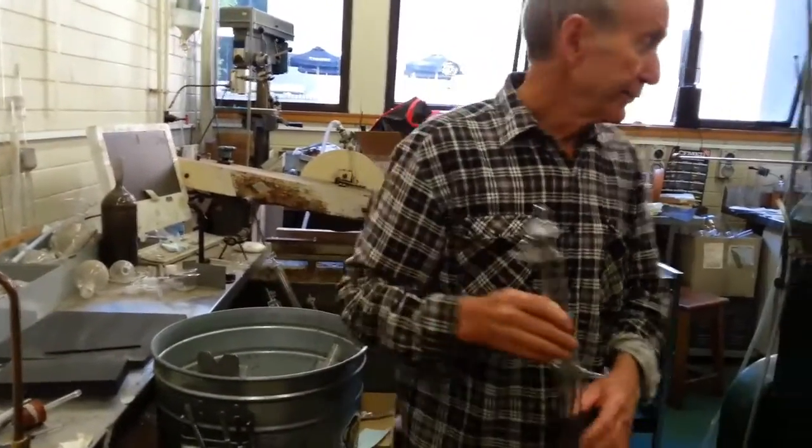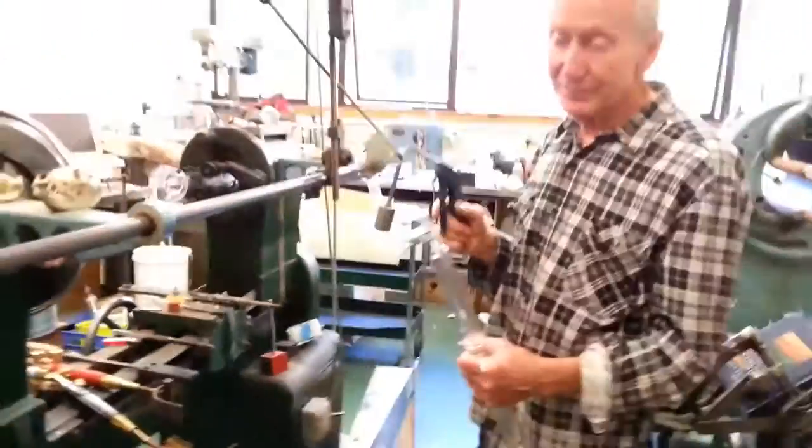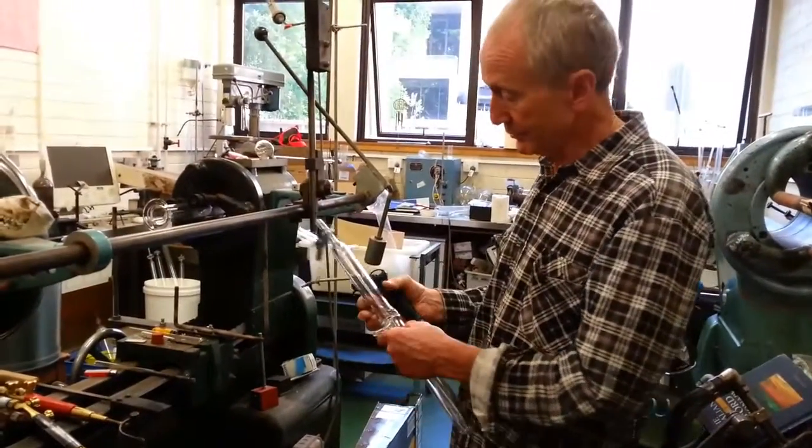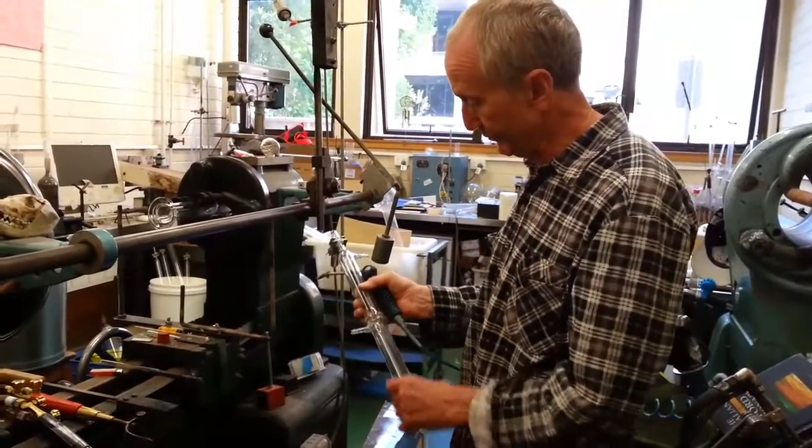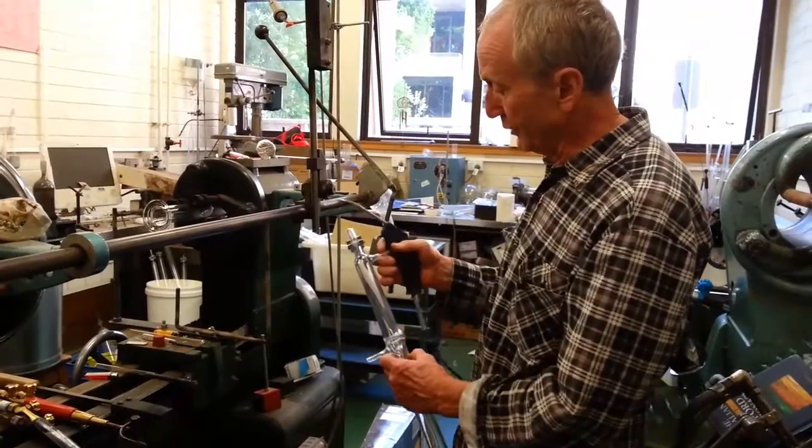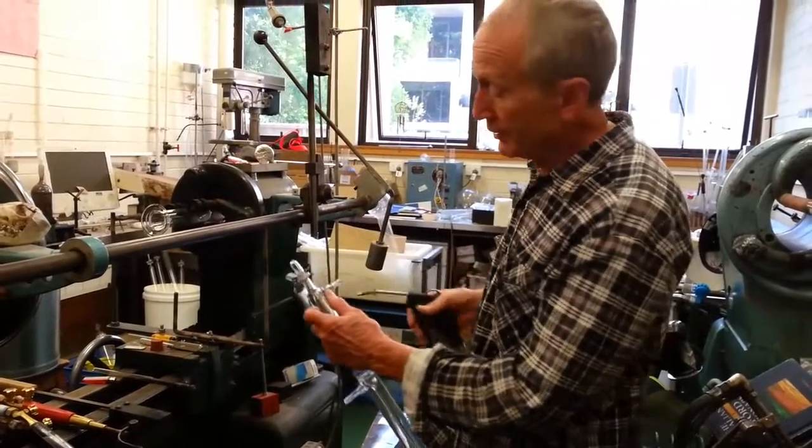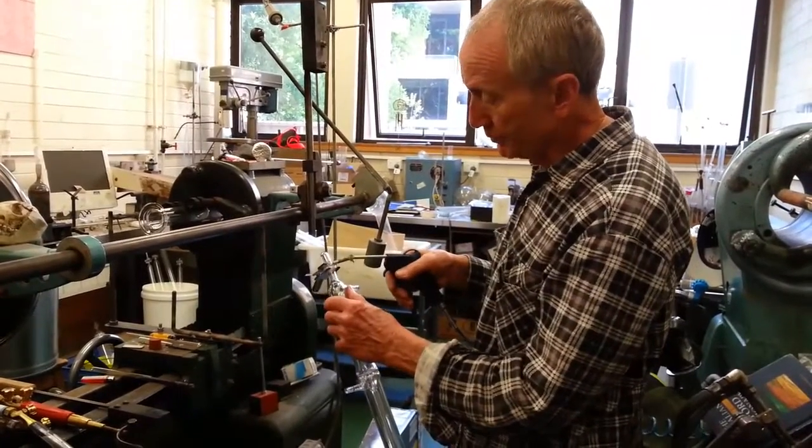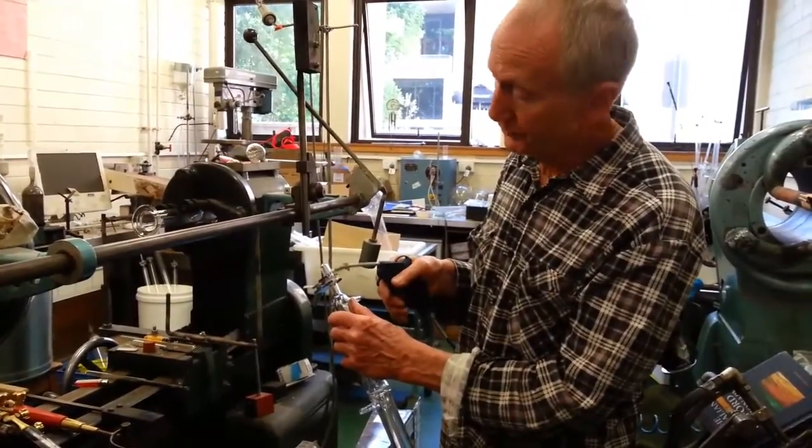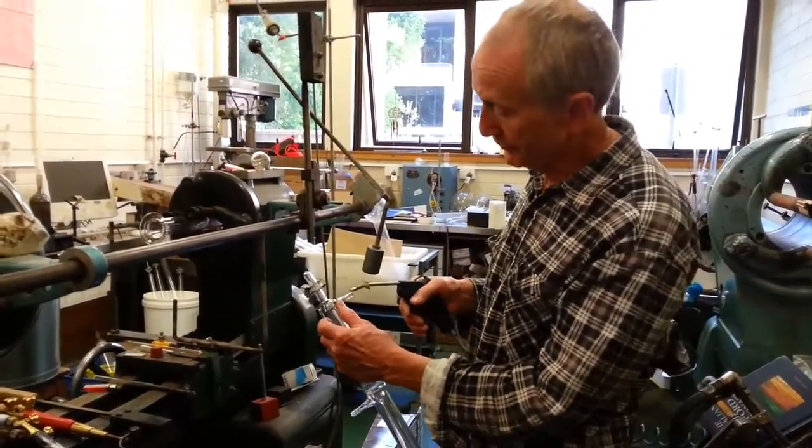Now, if we were to pressurize that at 100 psi, you wouldn't run nitrogen at 100 psi, but this glass is designed to safely work with 100 in case something goes wrong. But this here will probably lift at around about 15 pounds per square inch, about one atmosphere, that should lift up.